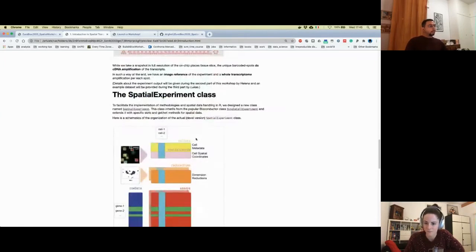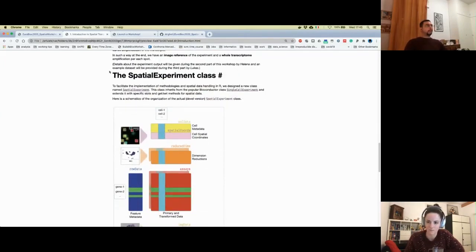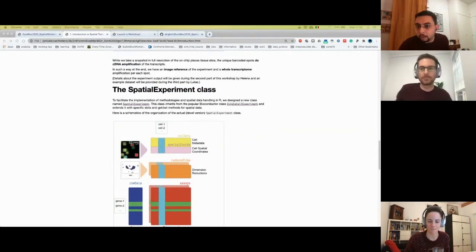Okay. To analyze this data, we came up with this SpatialExperiment class, which inherits from... One second, there's a question. For sure. How are cell boundaries determined?